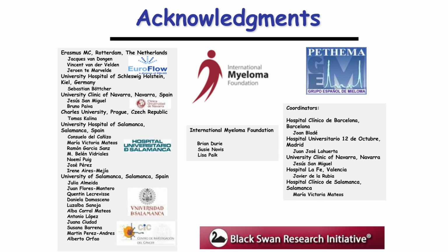Great, thank you. Our next question is, if you collect 20 million cells and analyze 10 million nucleated cells, what are the other events that are excluded?